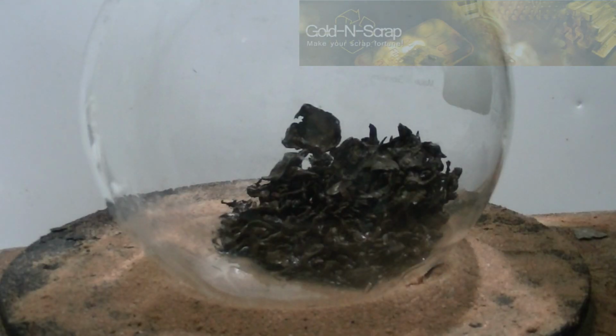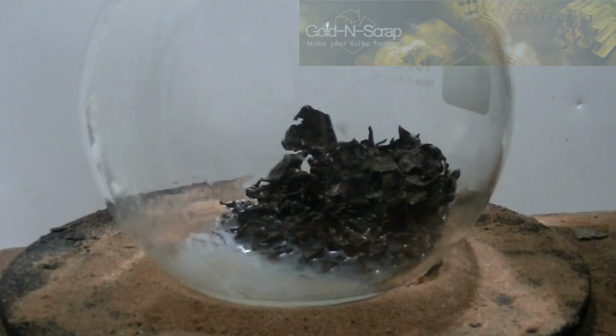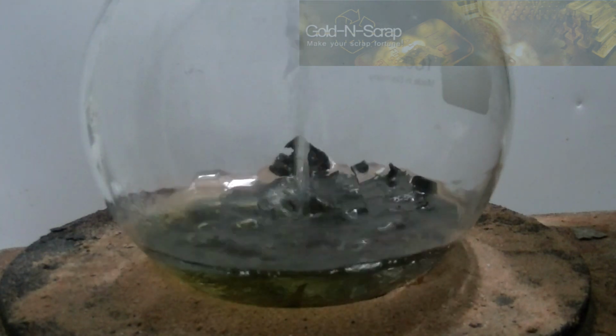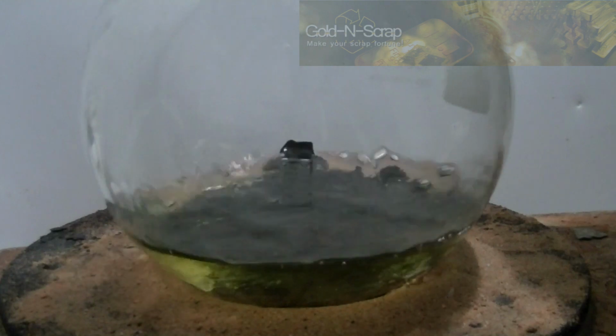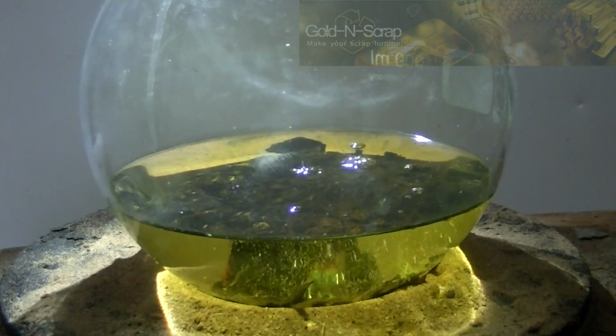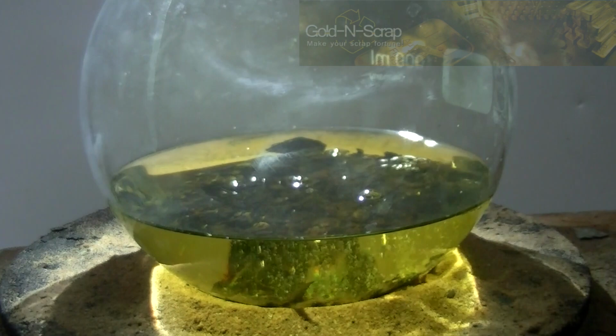Time to dissolve the gold with the hot aqua regia. Two things happen immediately as the hydrochloric acid is added. First, some silver chloride forms and redissolves. We'll deal with that later on in the process. Second, some gold starts to dissolve and give color to the solution. As the solution heats up, you can clearly see the gold being dissolved before any nitric acid addition.